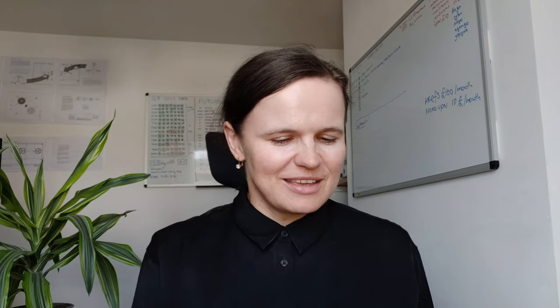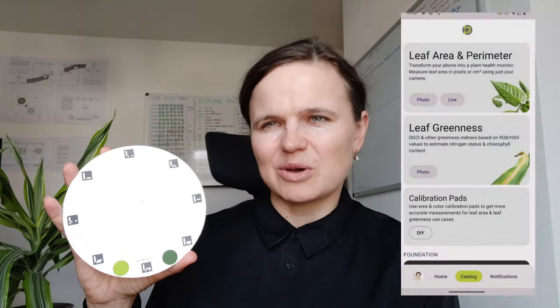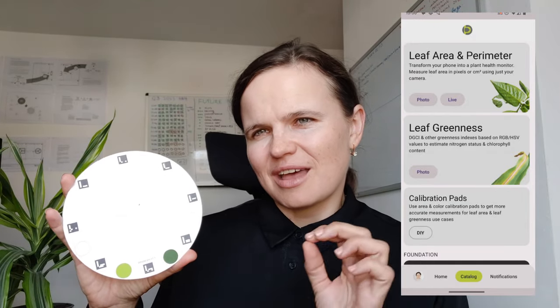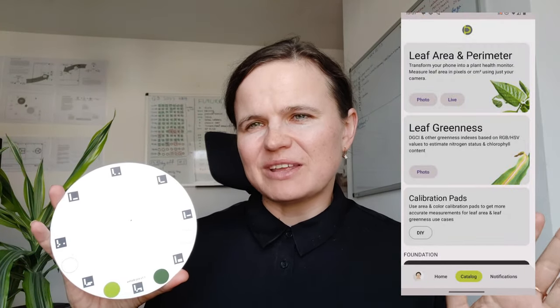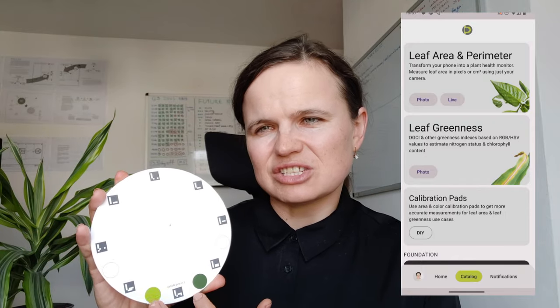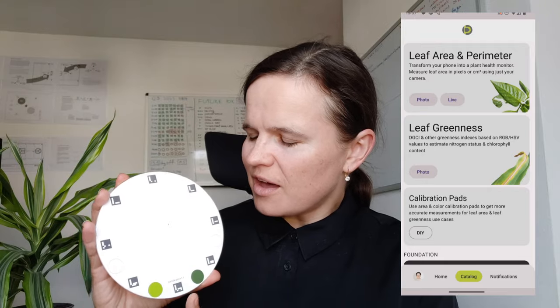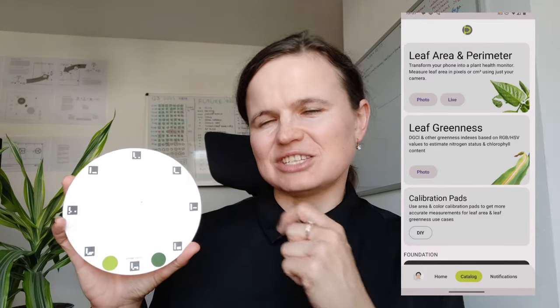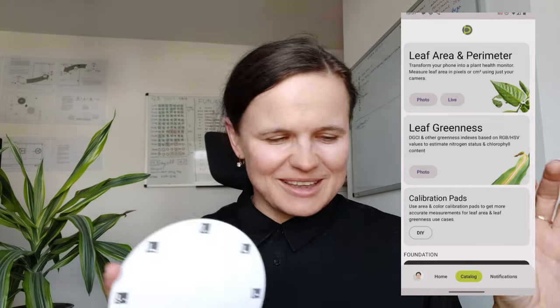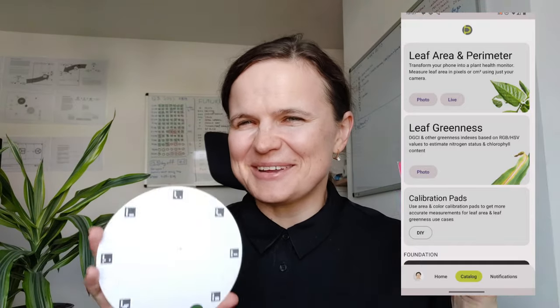Let's say you have already done your printing and you are ready to start measuring. You need to have your calibrating pad. In my case it has these two green markers — when you print yours, you will not have them because these are specific colors used for DGCI measurement that standard printers cannot reproduce at that quality. That's why this type of calibrating pad is handmade and we deliver them upon request. If you need such calibrating pads, please let us know. I will also explain a different way to measure DGCI, so don't worry about that.